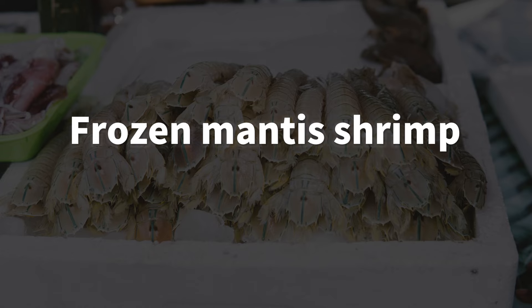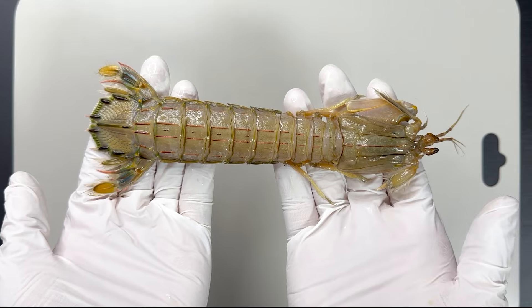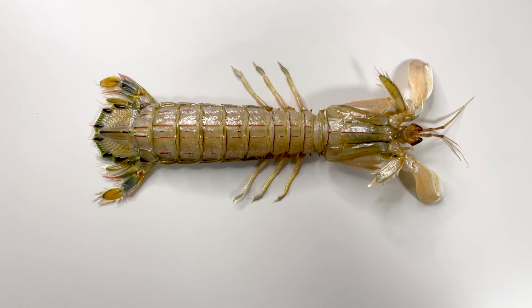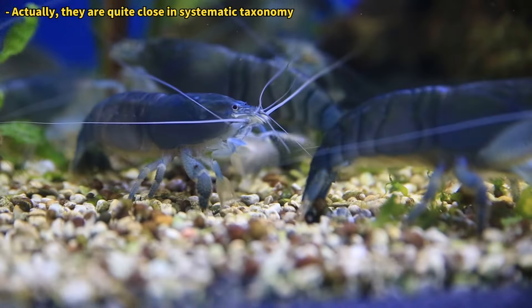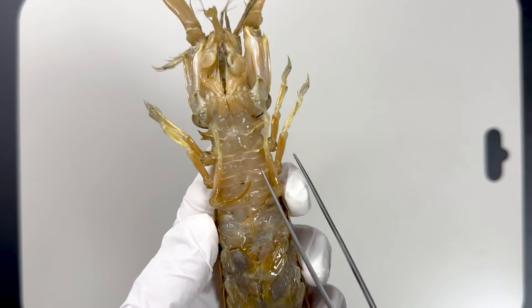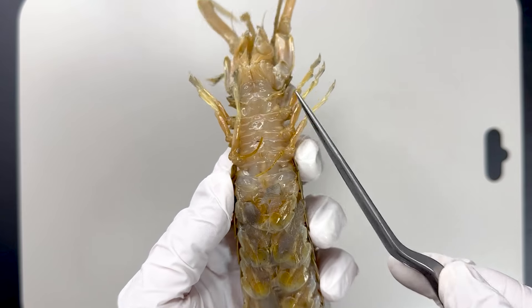I have here a frozen mantis shrimp that I bought for this experiment. When you extend its limbs, it slightly resembles an insect. Many crustaceans have this insect-like appearance and are often referred to as sea insects. However, among them, the mantis shrimp arguably resembles a large insect the most.